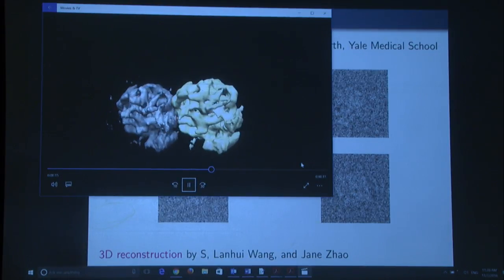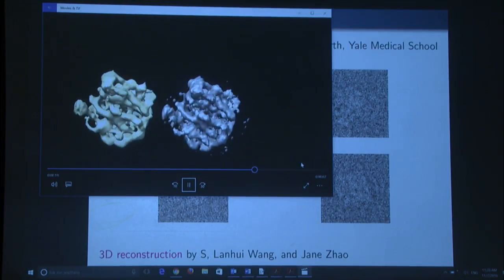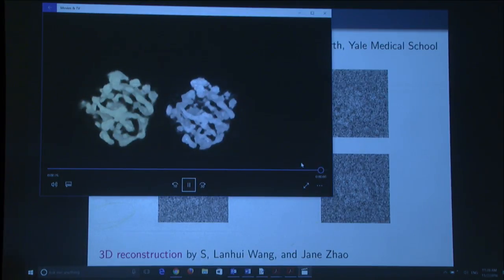Of course, I'm cheating here a little bit because you don't see X-ray resolution here, it's not atomic scale resolution. And by then we had a lot of improvements, both in technology and algorithm, but at least you can see that the structures are very, very similar. Okay. Why did it become fuzzy? Oh, we just filtered it.